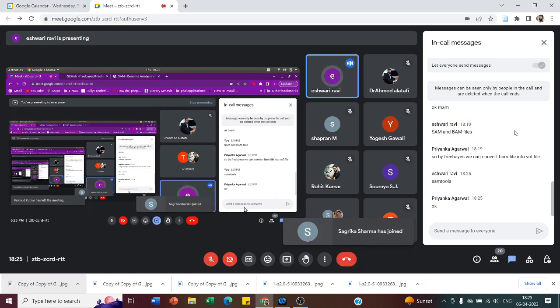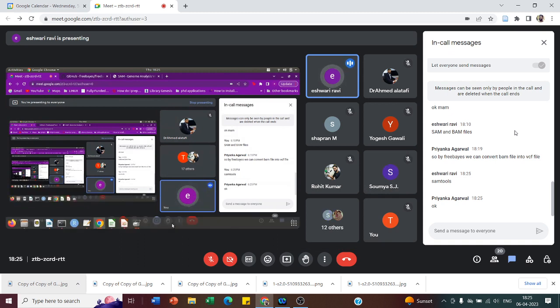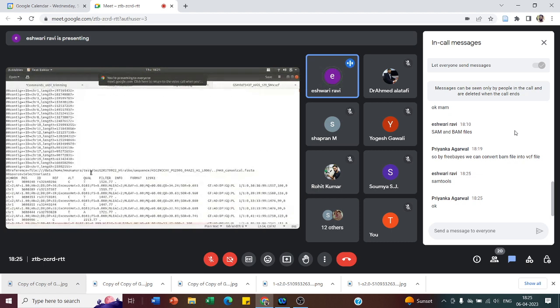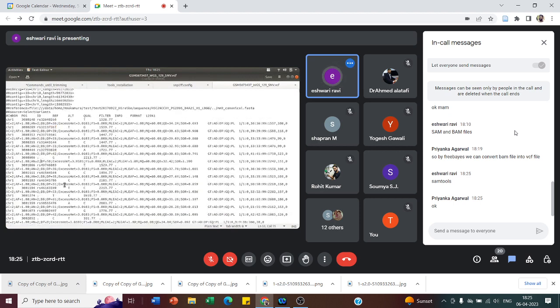Because when you perform whole genome sequencing analysis, you technically know that there are certain normal samples, certain test samples or infected samples, and you are expecting variations in those test samples. So to know what variants are present in what samples, this is how you call those variants, and how you refer to them and understand them, and these are the IDs. You can always take these IDs and search in your genomic databases. It will give the information each of these IDs carries.